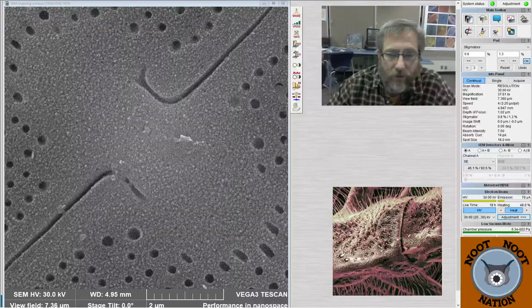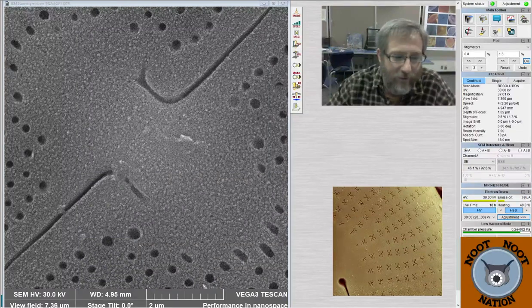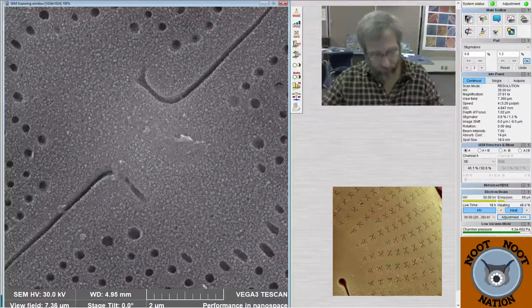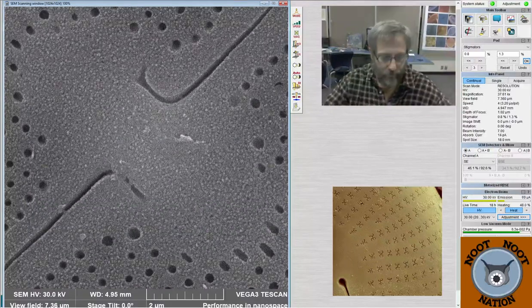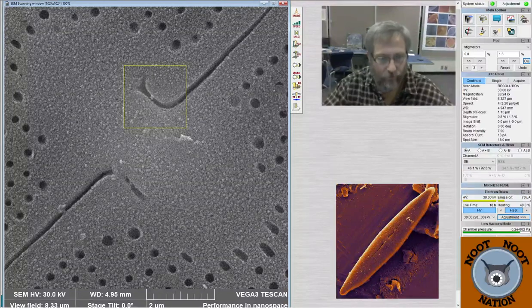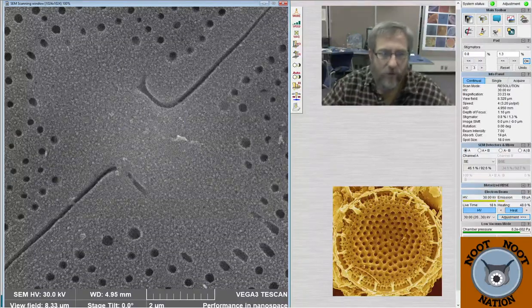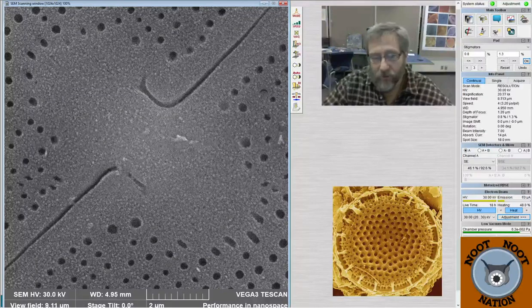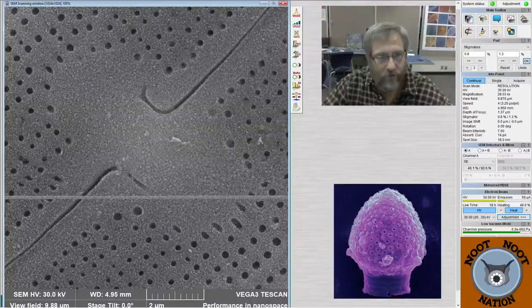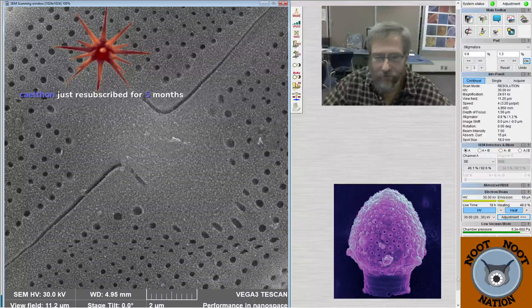All right. Today we're going to do a little bit of time on the SEM. And I have some materials here from Clear Lake, which is a lake in Iowa that my graduate student Addie has been working on. We spent some time on Wednesday looking around at some of Addie's samples, and she was mostly focusing on little Fragilaria.